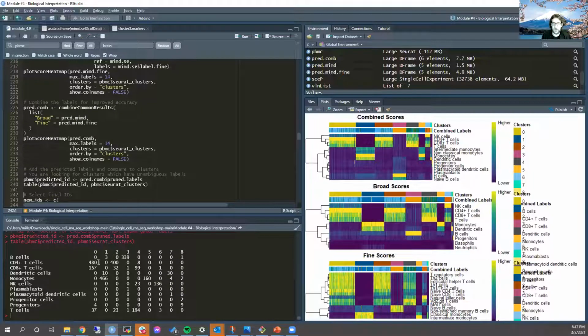If we wanted to really verify this, we could go through it with a finer tooth comb. But since this is just a first pass analysis, I'm pretty comfortable saying cluster 0, CD4 positive T cells. So let's do one more.